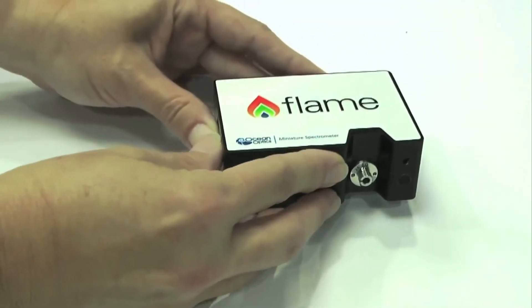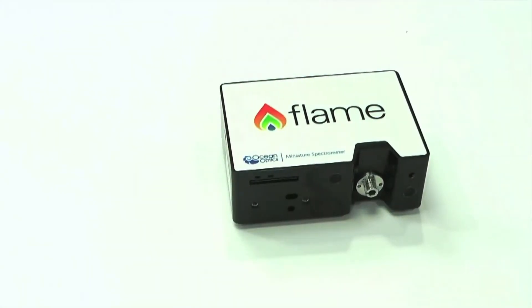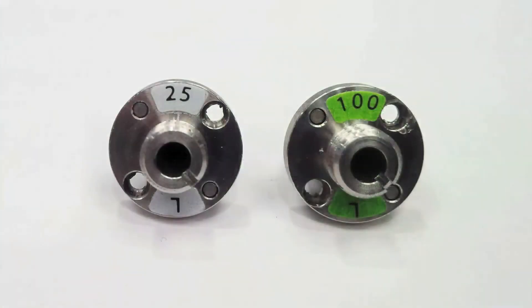The Flame S Vis NIR is a powerful spectrometer in the palm of your hand and is great for basic absorbance measurements. With its speed, accuracy and versatility it achieves excellent results. The absorbance bundle also comes with a set of interchangeable SMA connectors.